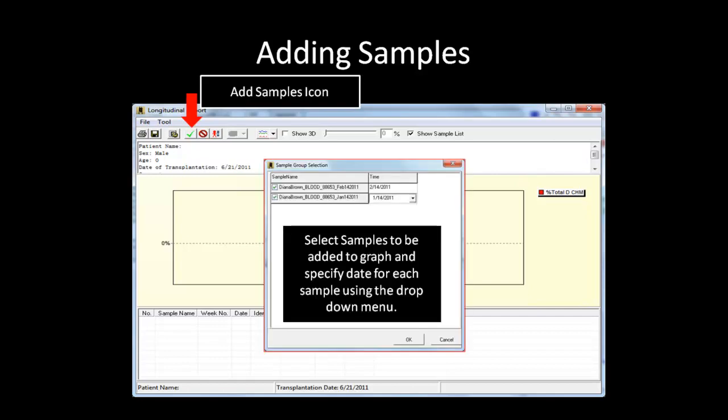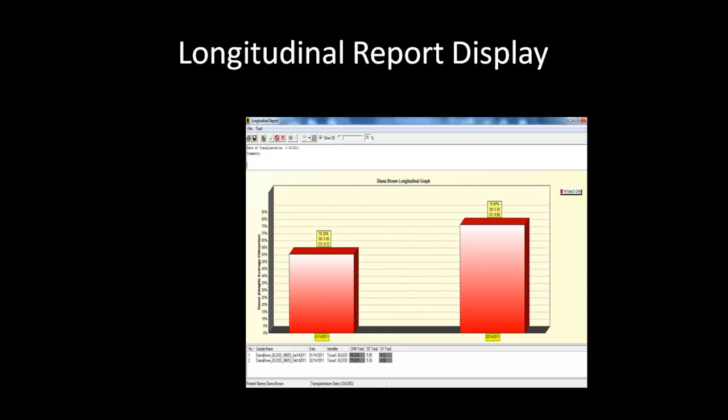A dialog box will appear with a list of the samples currently in the project. Select the desired sample and use the drop-down menu to specify a date for each sample. The same method for adding samples applies to double donor analysis as well. Click OK when you are finished selecting your samples.